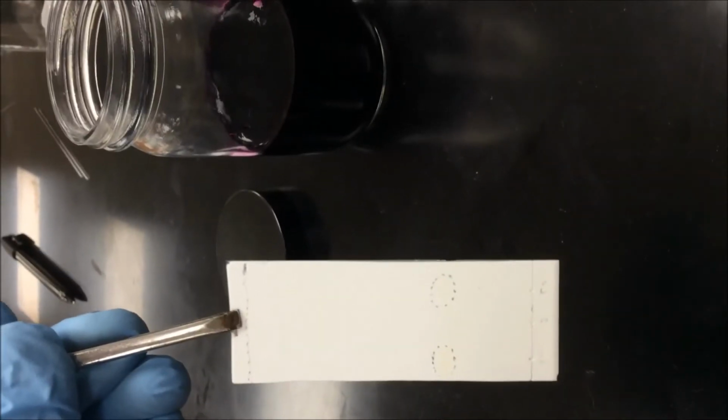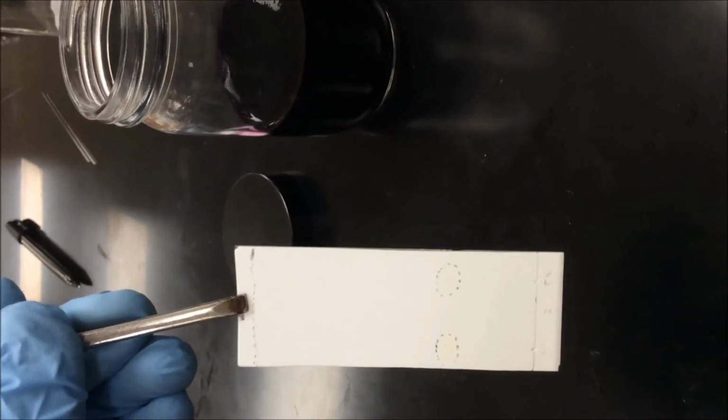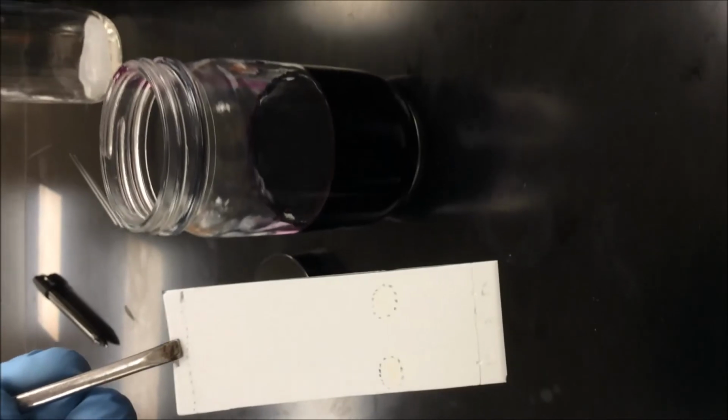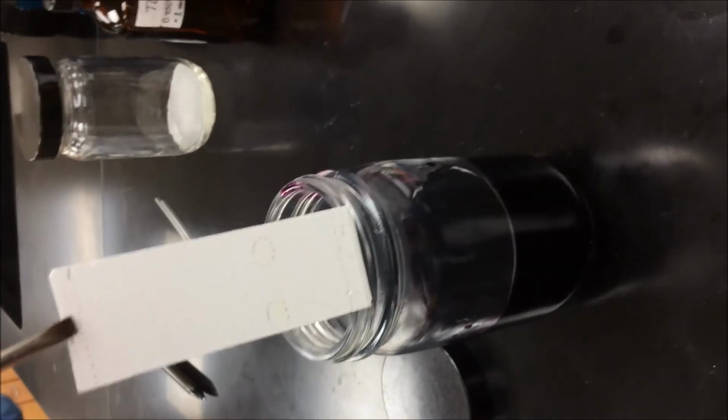Okay, so hopefully you can see the little yellow spots for the orthonitrophenol, but it's kind of faint and difficult to see, and you probably cannot see the meta anyway. So I'm going to just stain that in the TLC jar, and let's see how that shows up.